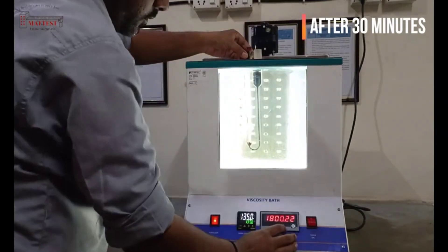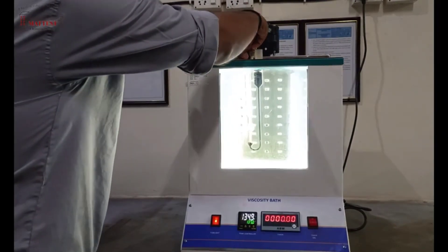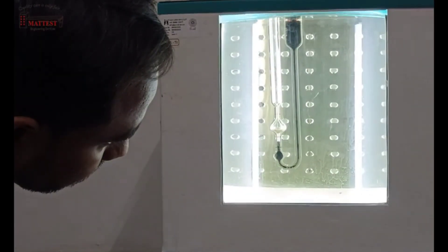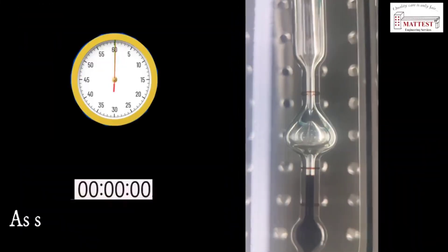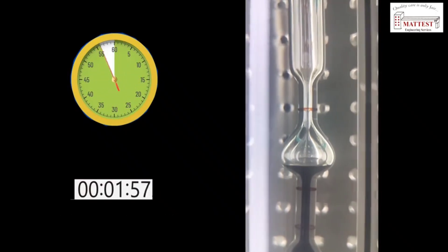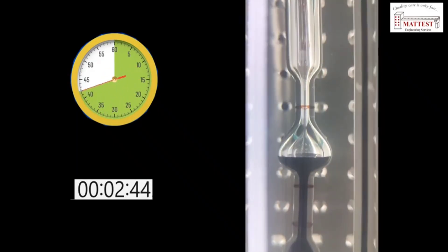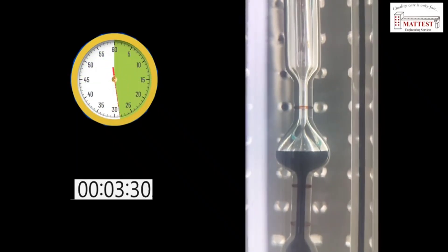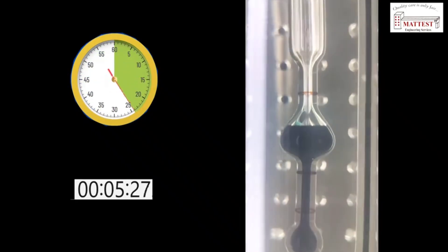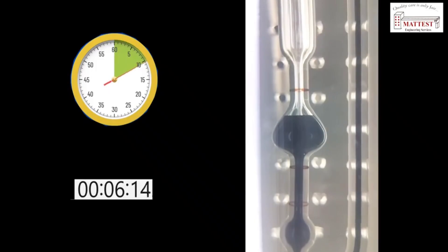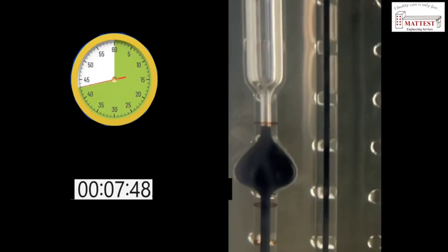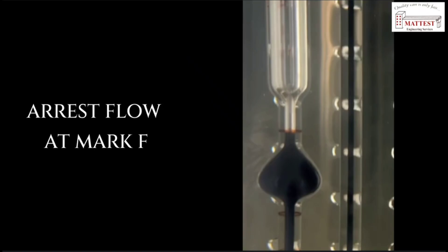After 30 minutes, remove the rubber cock from the tube. Measure the flow time from mark E in the viscosity bath.